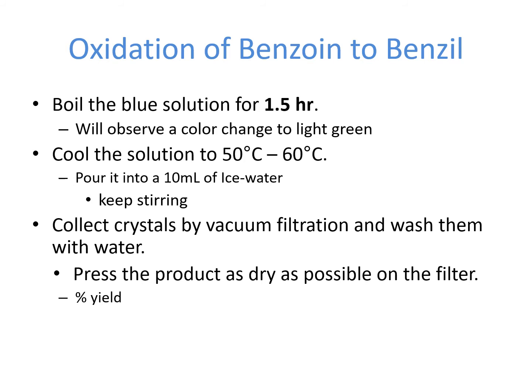And here we need the crystals to be as dry as possible, because we need to weigh them and then calculate the yield in the end. Unless we get the accurate experimental yield, it will affect our calculation of percentage yield in the report.